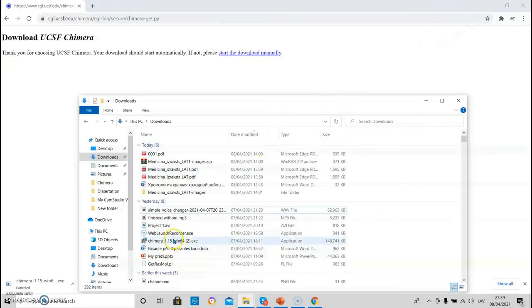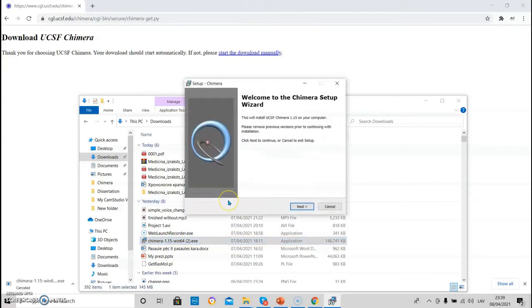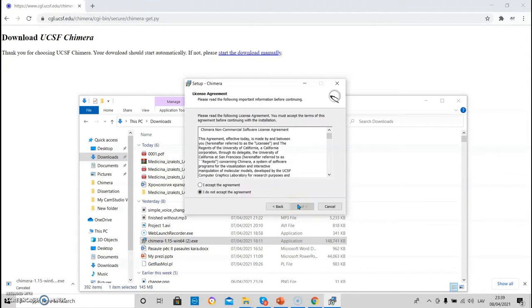Once it is downloaded, you have to find it and launch the installer. The Chimera wizard will open, you have to press next, then accept the agreement.